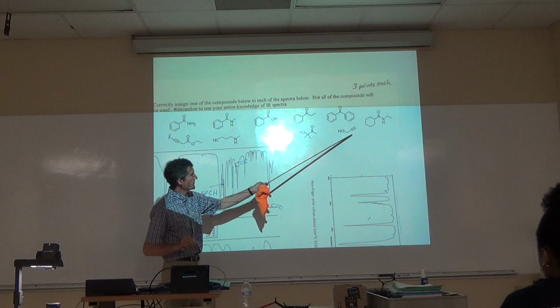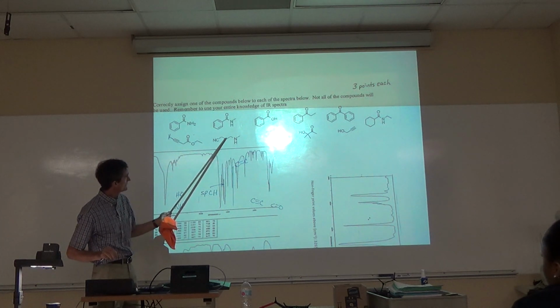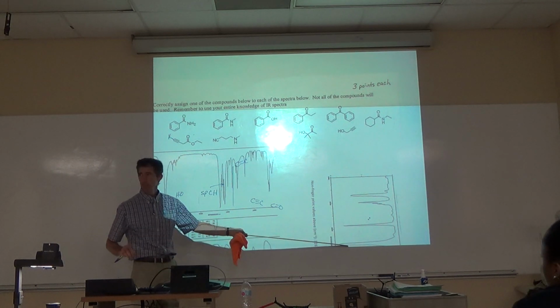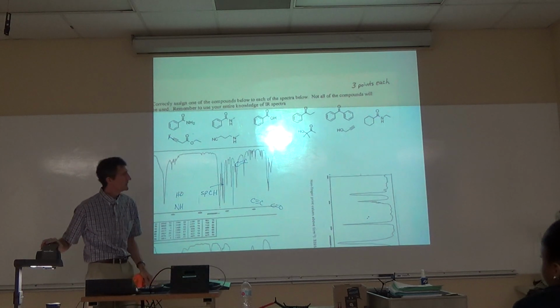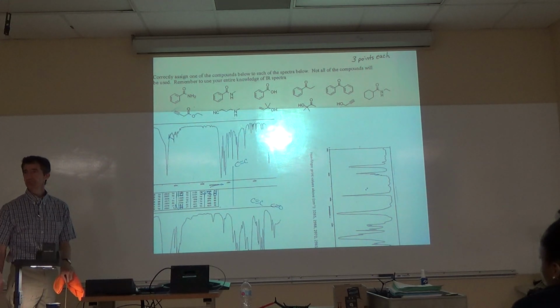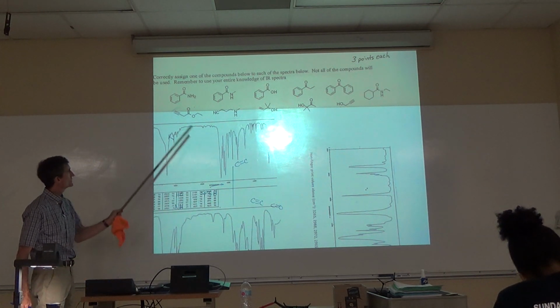That alkyne has no carbonyl. This triple bond, could that be this one? Maybe that's the NH. Maybe that's the cyano group. And then we can just ignore that big peak, right? That peak doesn't mean anything. Wrong. That's a huge peak in the carbonyl region. Looks like a carbonyl, yep. So you would not choose this because that has no carbonyl. So I'm thinking all roads lead to this one here.